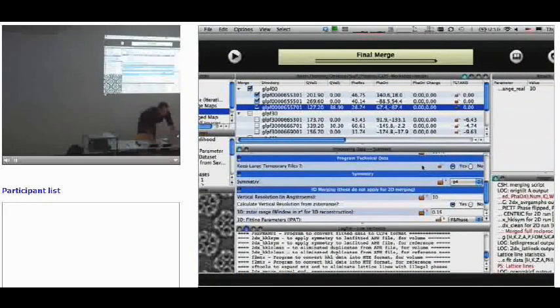And then this is our software, 2dx Merge. And the purpose today, what I want to show is how to use this for merging. Behind, we run the pure MRC software. And in the merging step, we modified very little, mostly only cosmetic to get the output into the log file window, and the images that are produced show up here. You can always double-click these things, and if variables are determined, then they show up here and go back into the database. The result things that show up here, they can be images, and if you double-click them, you open them in the full-screen browser.